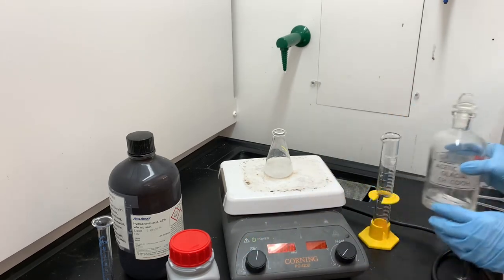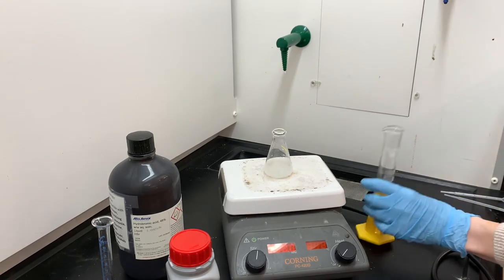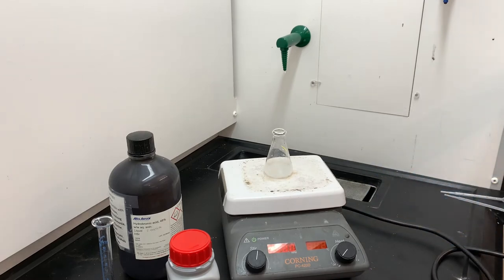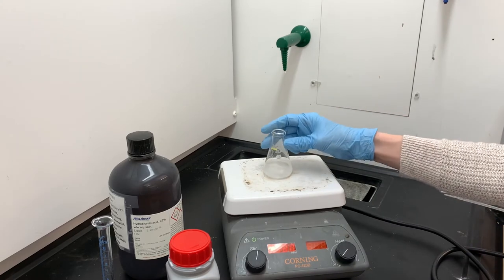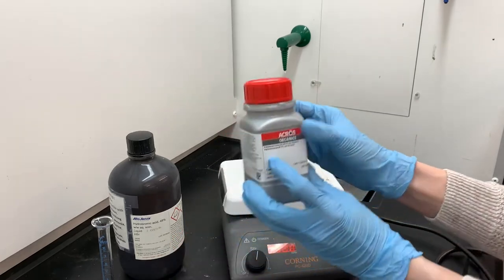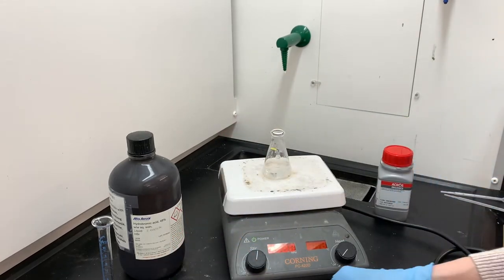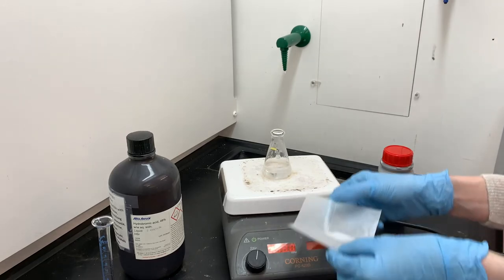The glacial acetic acid is one of the three ingredients or chemicals that are being used to synthesize the Br2 molecule in situ. Remember, that's just a fancy way of saying that we're synthesizing the bromine molecule inside this flask rather than putting the bromine molecule directly in the flask. The next ingredient that we need is the potassium bromate, which I've already measured out at the balance, so I'll just be adding that in.